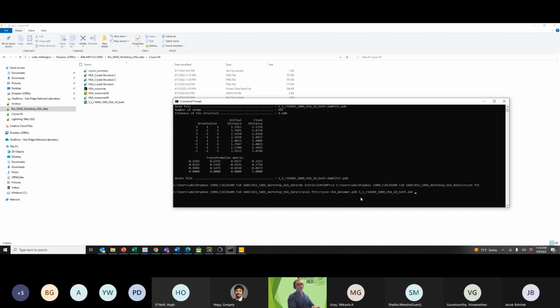D2O buffer you are studying that sample. So you can just say slash D2O slash dash D2O, and there was 100% D2O. And 90% D2O is 0.9, and similar for the other D2O contents. You just press enter.